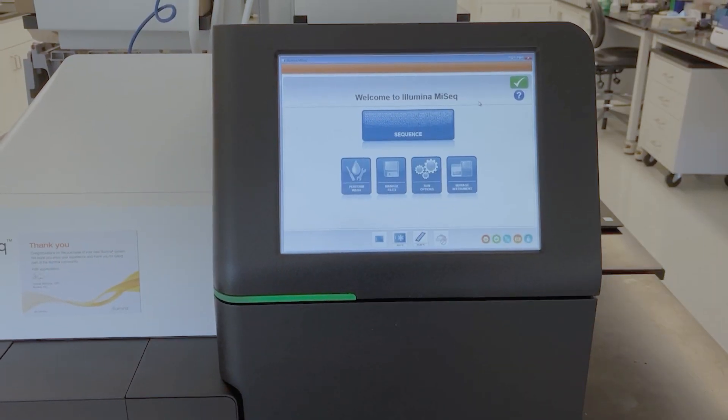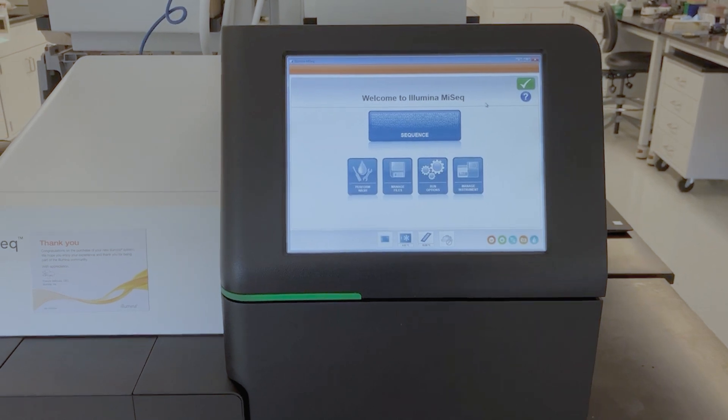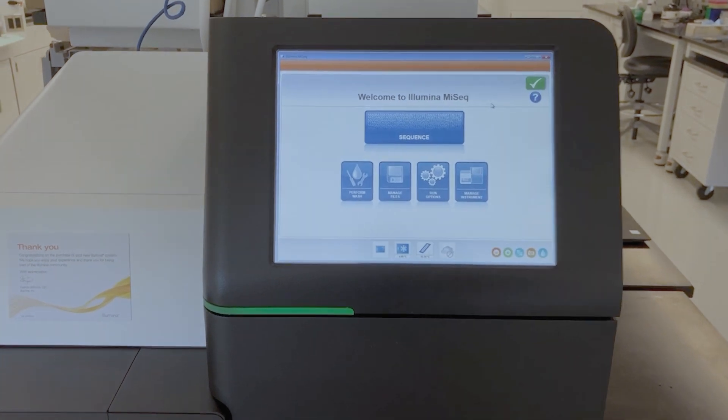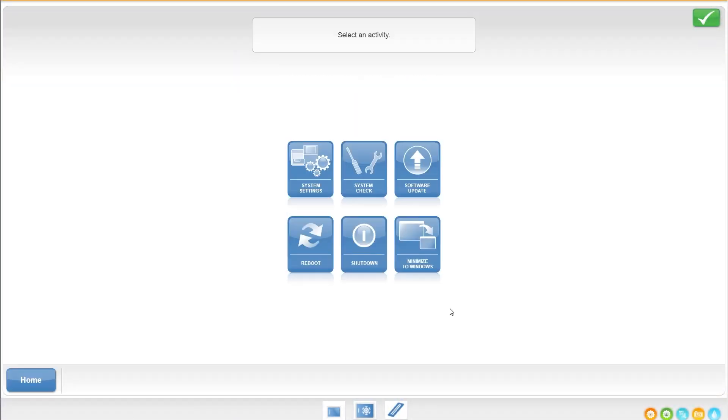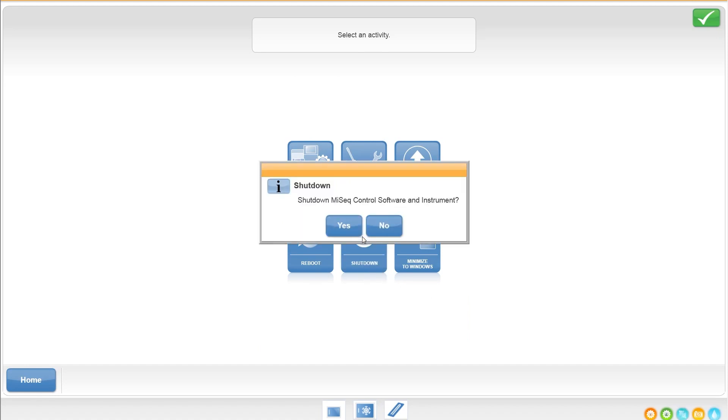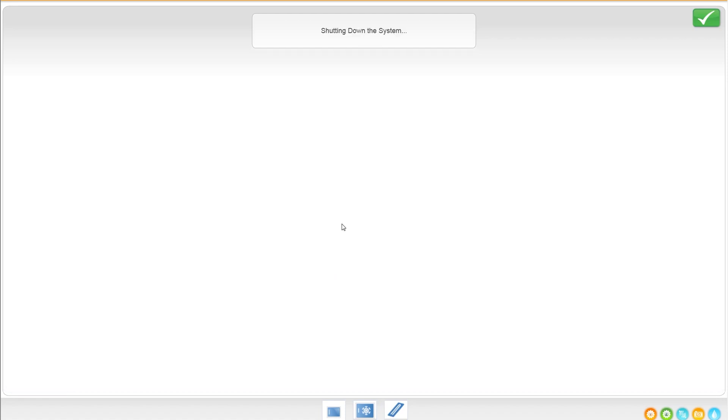If the instrument is running Windows 7, go to manage instrument on the home screen. Select shut down. Follow the prompt to shut down the MySeq control software and the instrument.